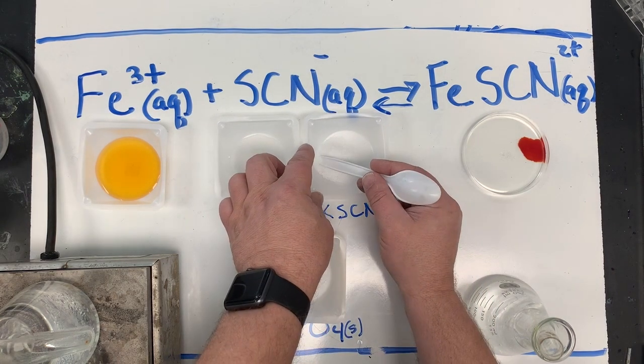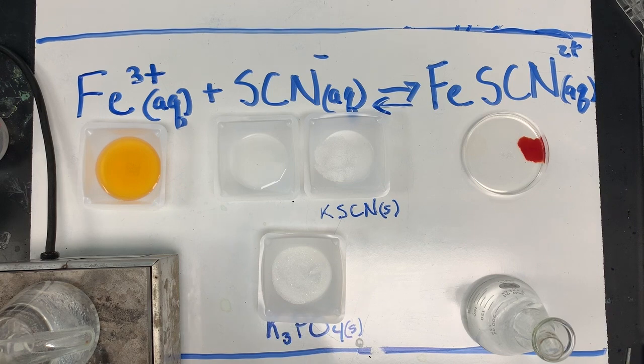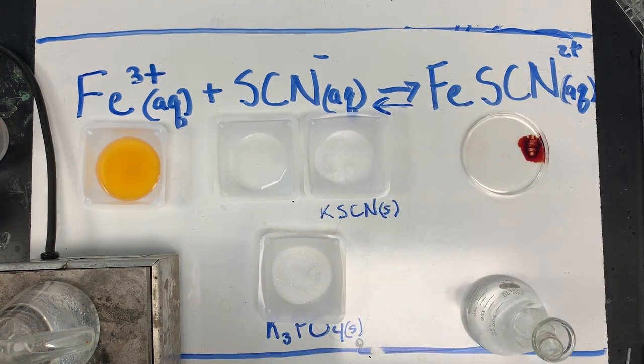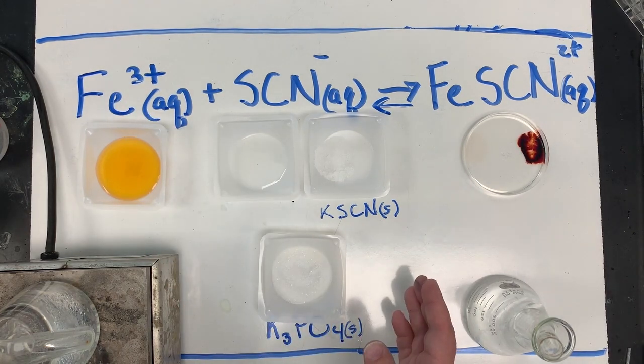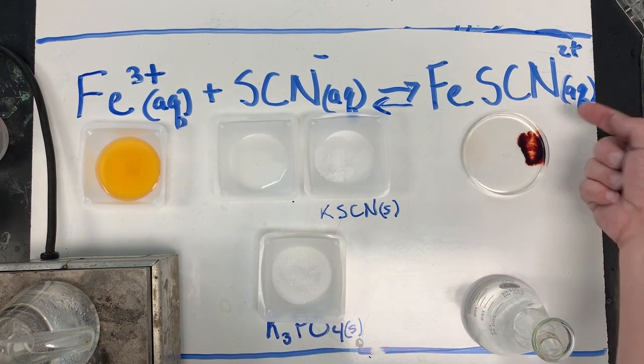All right, let's try another chemical. This time I'm going to put this one over here and I'm going to place another over here. What's going on? In our solution, where do we find the iron 3 plus? In our solution, where do we have thiocyanate? Where do we have the complex ion?